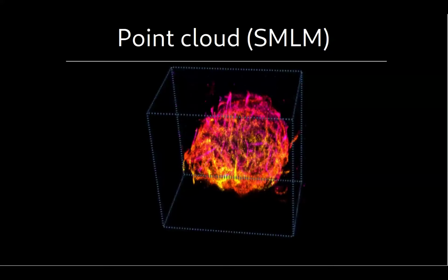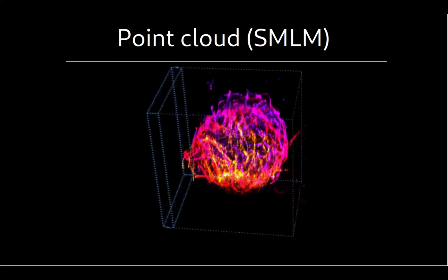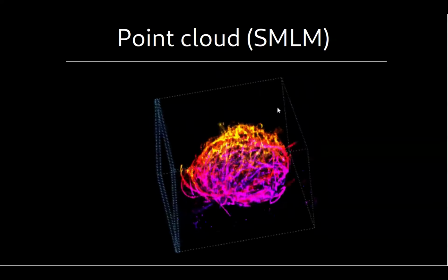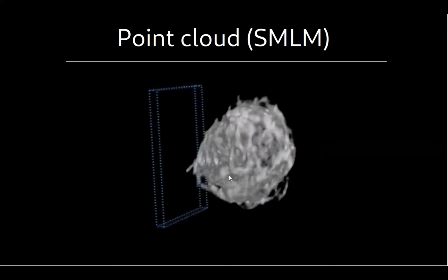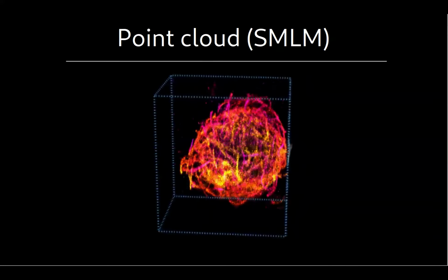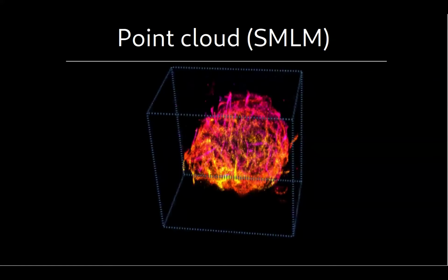And in principle, you can use this to compare different reconstructions next to each other. So this data set is something around 10 million points, and this is all rendered on my laptop, so it works pretty smoothly. And there is one data set also in example data where you can play with it and see how you adjust and play with things.